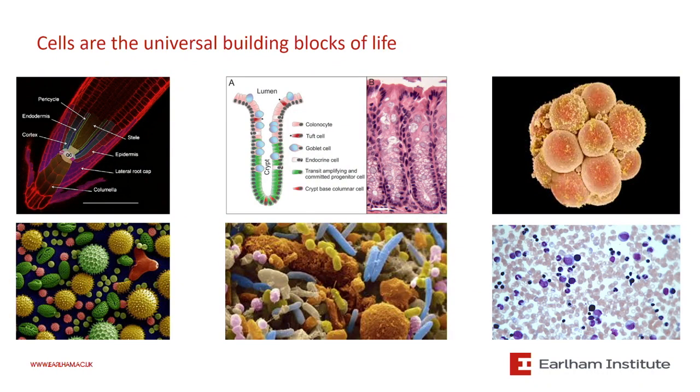And I guess we're at a human genomics or genetics conference, so a lot of the tissues and cells that people would be interested in would be on the right-hand side of this screen, so blood and developmental systems, and gut as well. But also, these technologies can be applied across the spectrum of living systems. Because everything is made of cells, we can use single-cell technologies to reveal different levels of information about everything from plants to microbial life, as well as developmental systems and disease systems as well. And actually, because of where our institute is situated, we work with a lot of plant biologists as well as microbial biologists, and trying to apply these technologies right across the spectrum.